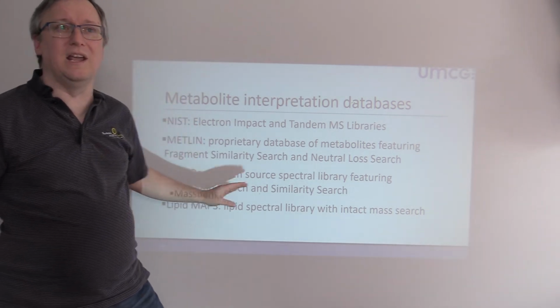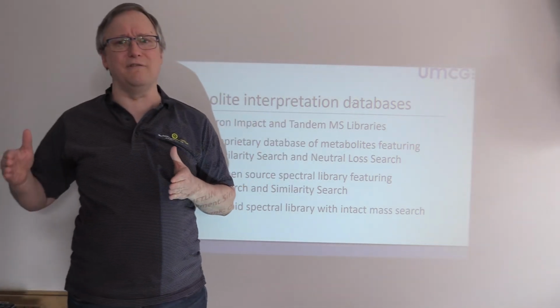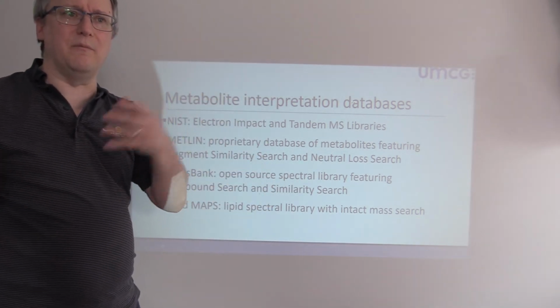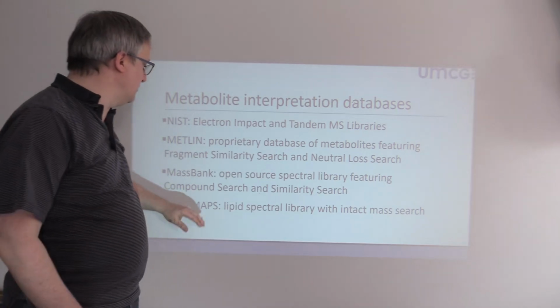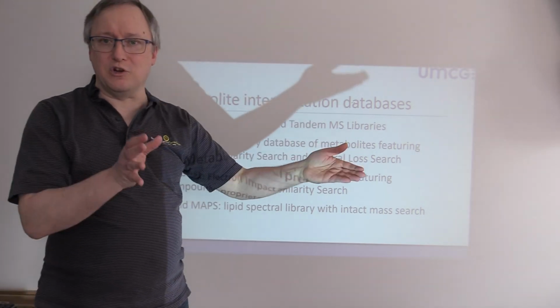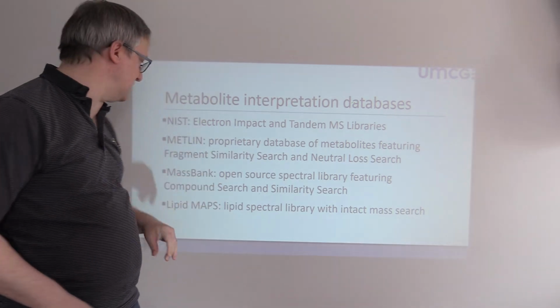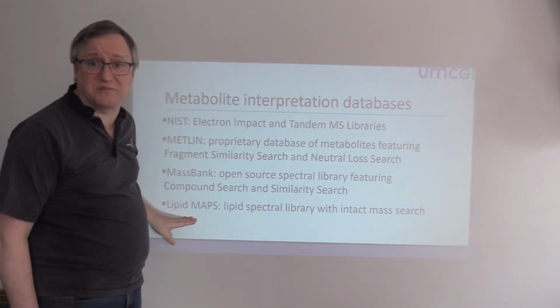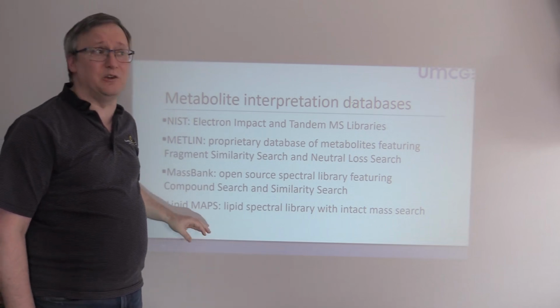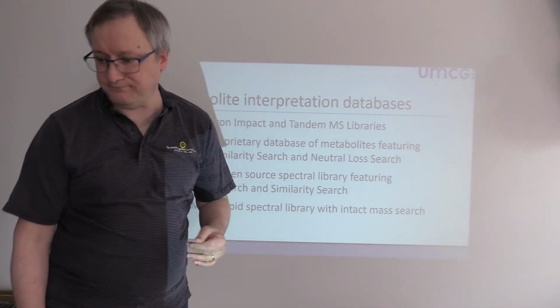MassBank is really cool, and there's even an interesting side project called MassBank of North America, which has added a whole bunch of things through Oliver Fiehn's group. So they're effectively the Japanese and European mirror sites, and then there's the MassBank of North America, which is a separate project. And LipidMaps is definitely worth talking about, because if you're dealing with tandem mass spectra of lipids, you want to be sure that those are well represented. LipidMaps has a very good answer for you.